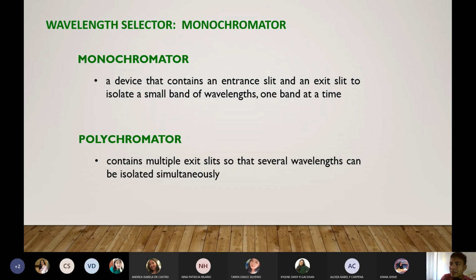Okay. So now, na-discuss na natin yung ating light source. Ano sunod ng light source? Yung syempre sample, then yung hindi. Mali. Nasa isip ko yung emission eh. Okay, so sa fluorescence pati sa absorption spectrometry, okay, you have the light source followed by the wavelength selector, also called the monochromator.